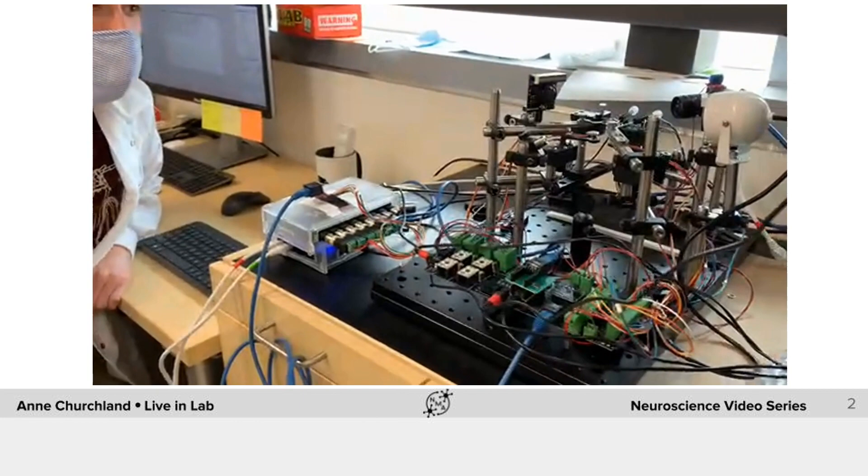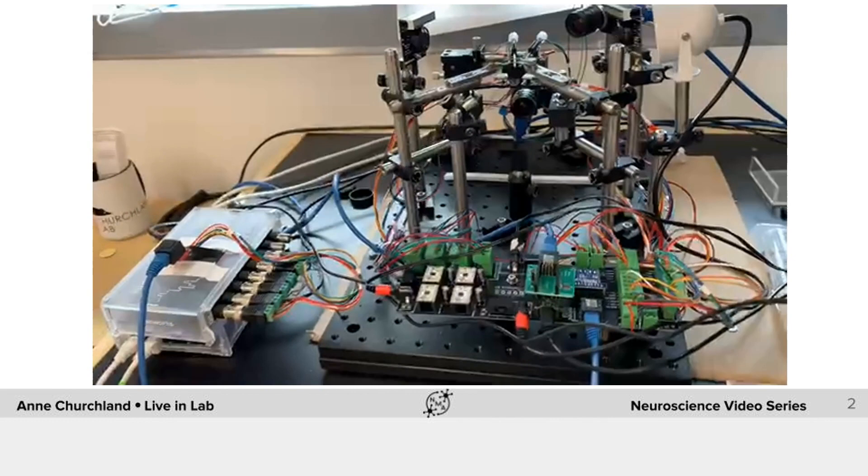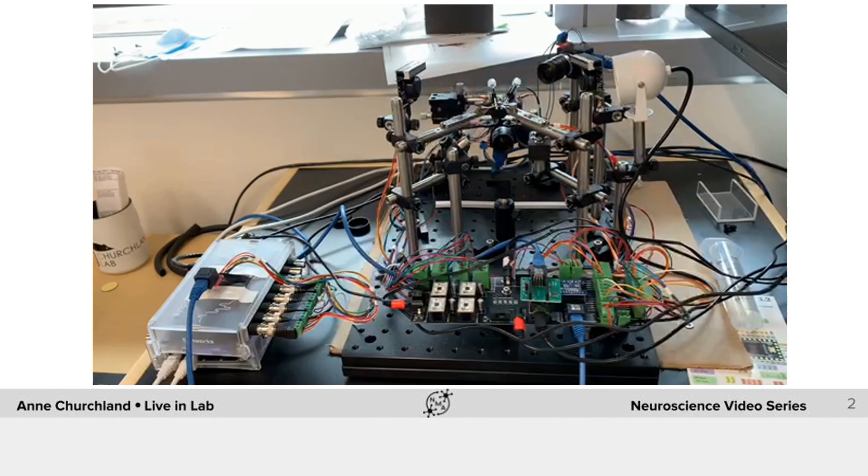Yeah so as you can see here this is our head fixed setup which has a number of sensors which also allows us to deliver auditory and visual stimuli and we can put this directly in the wide field setup so that we can image neural activity while the animal is performing a task.